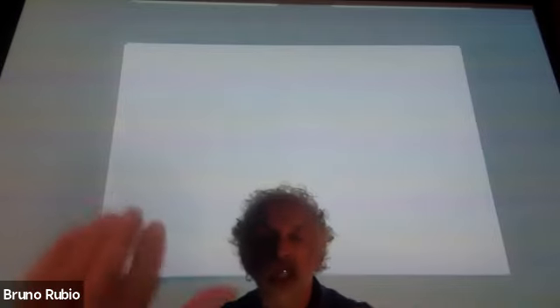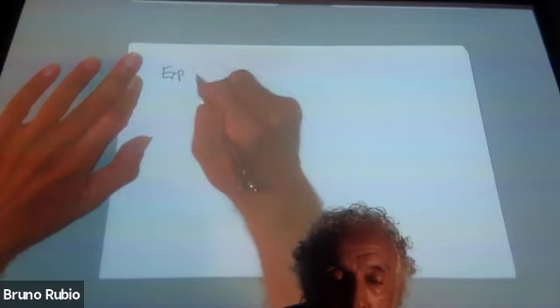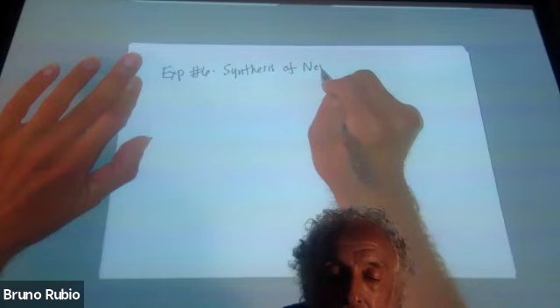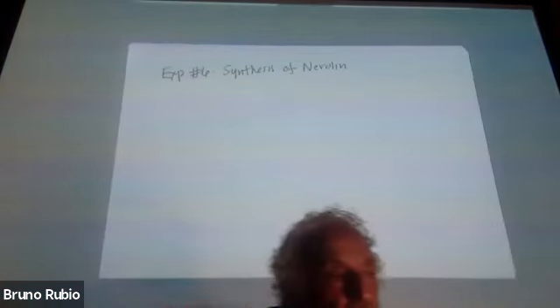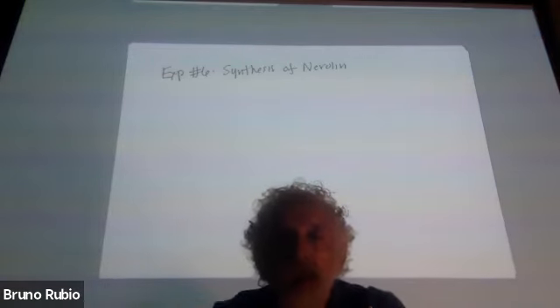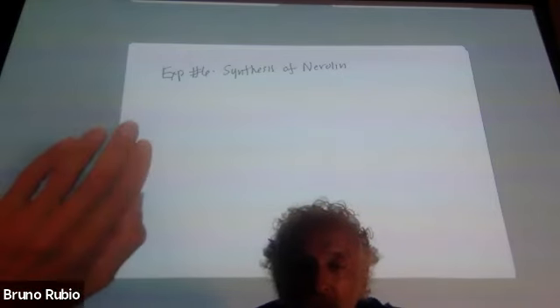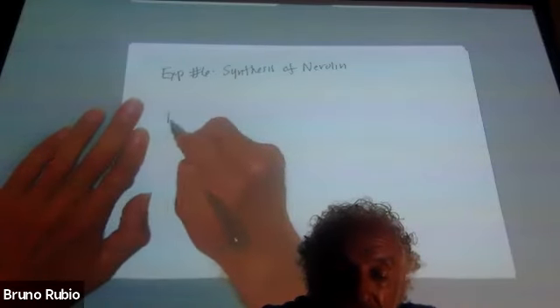All right. So last experiment, experiment number 6, which is about the synthesis of nerolin. Nerolin is a perfume fixative. So it has a mild aroma of its own, but it's usually used in personal care products to help support the more aromatic principles that might be in there. So, you know, the cologne and the perfume, they stick to the skin because the nerolin sticks to your skin. And so it's a perfume stabilizer and fixative.